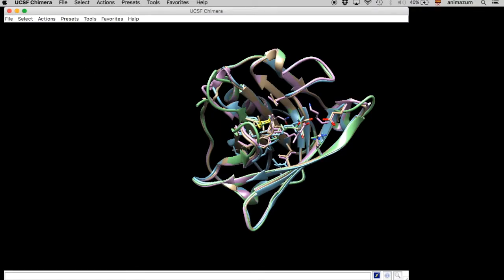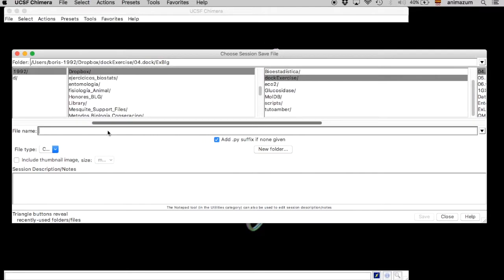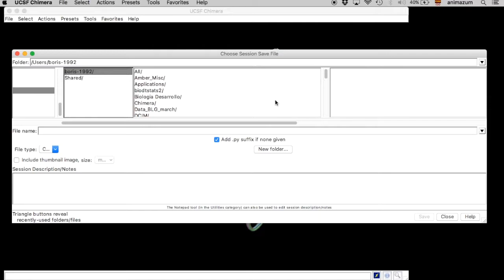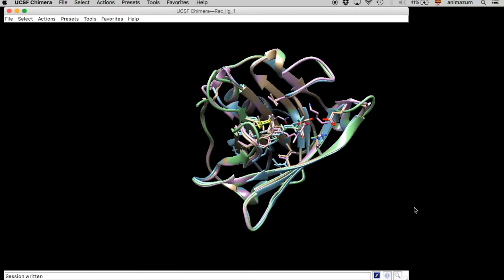We are going to save the session, so if we do something wrong we can start over from a point that is not the very beginning. I have to find the folder and the file. Here they are — save it using the name that you want.